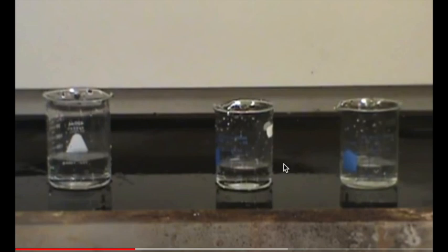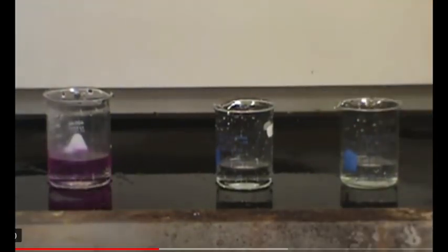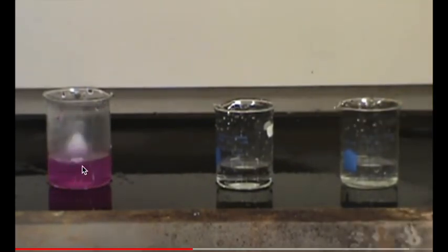As it happens with this specific indicator, it is colorless when it is acidic, and then it will be pink when it is basic. So what we're going to do is add a piece of the metal of interest, and then we're going to see what happens. You can see the addition of the metal here causes the solution to turn pink, which tells you that a base has been created, right?